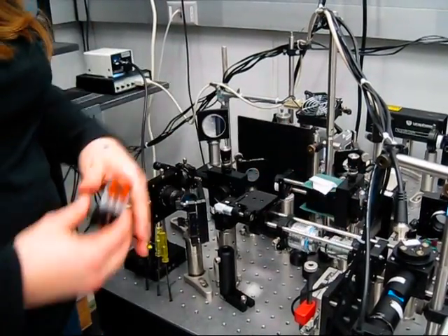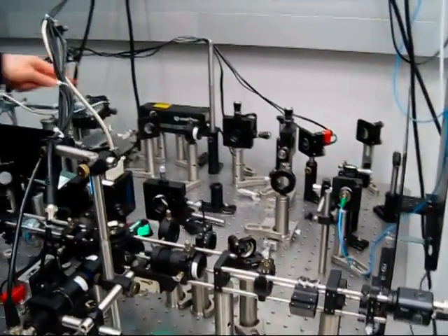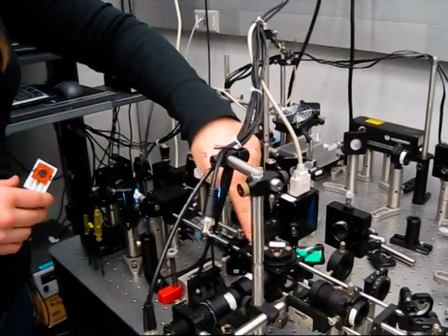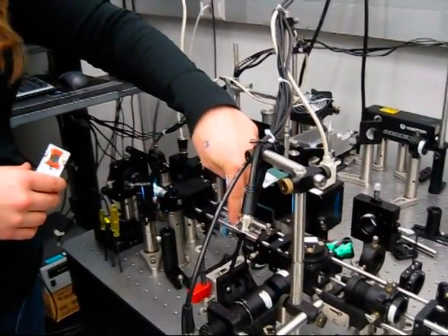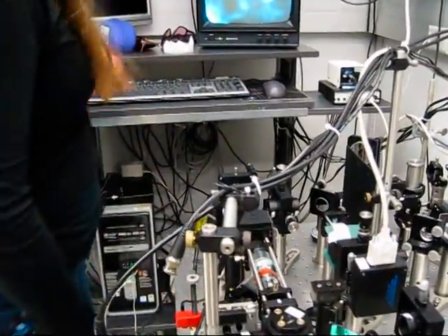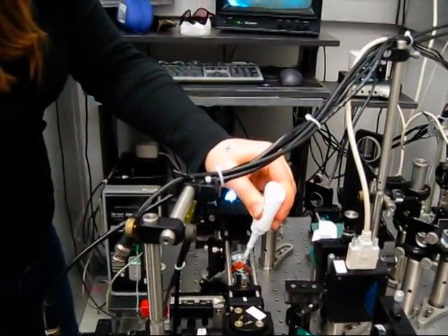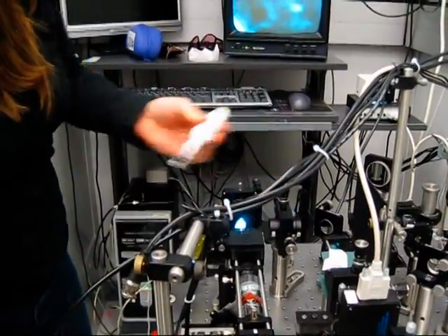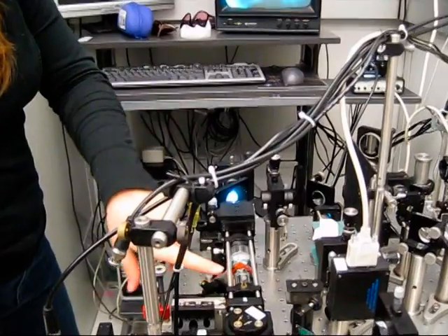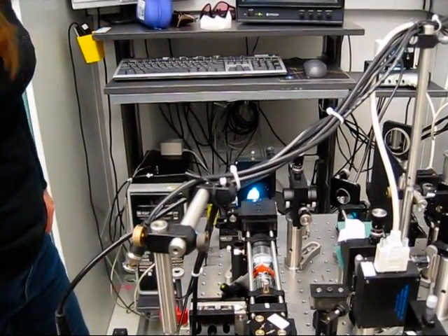The objective lens sends that light down to the camera. The trapping laser comes in from this direction, is coupled in with a dichroic here, and is focused into the sample and acts as the trapping laser. This is an oil immersion objective lens, so I have to put some oil in between the first cover slip and the objective. My sample holder is connected to this stage, which moves it in three dimensions.